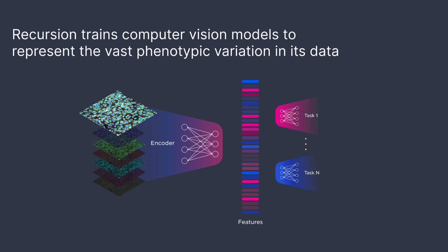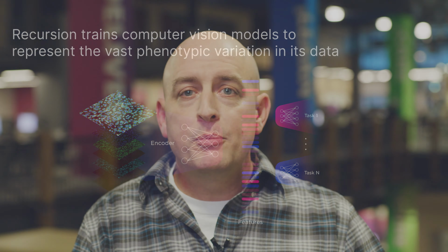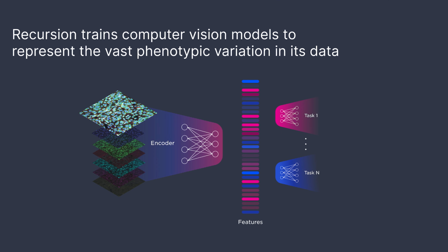This dataset contains a massive amount of cellular morphological variation. In order to properly capture the biologically relevant morphological characteristics of each cellular image, we train neural networks to perform a variety of tasks with these images and use intermediate layers from those models to provide embeddings or representations of those images. Training perturbation classifiers on well-chosen subsets of this data yields models that not only generalize extremely well out of batch, they produce biologically relevant features that perform well in many downstream drug discovery tasks. How to best learn representations of our phenomic data is an ongoing research topic of primary importance at Recursion.